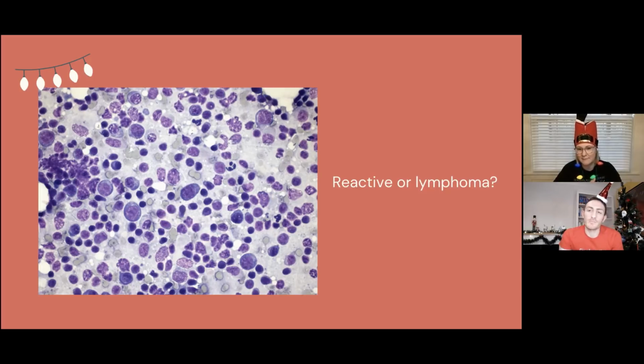But basically, if the lymphadenomegaly is not resolving, if it's unexplained, continues to be unexplained, they may need to do additional diagnostics like histopath or molecular testing, to rule out a lymphoma that we're not seeing on the cytology. But in any case, we still want to evaluate the lymphoid population, see what we think about it. So in this case, I would look at the lymphoid population, and I think my arrow is working.